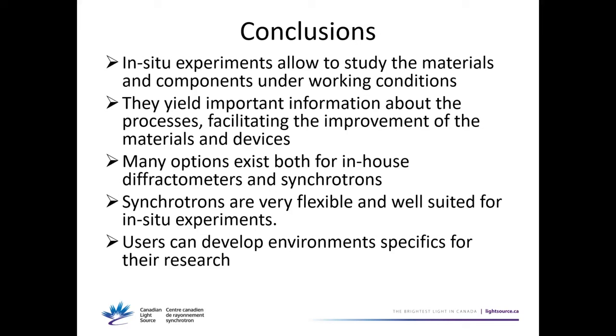For a specific new setup, I guess the best approach is to contact the beamline scientist and start working with him or her, and it will happen together. It's a commissioning and developing effort. Yes.